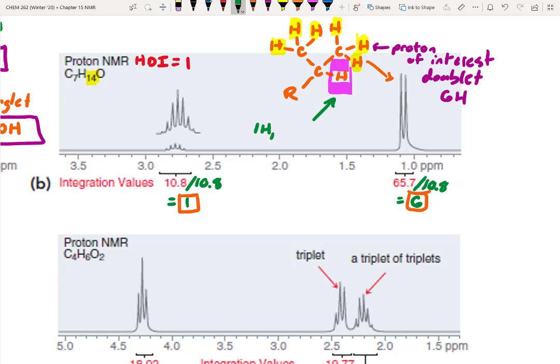Septet. Okay, which makes sense over here, because when I'm counting, I'd say 1, 2, 3, 4, 5, 6, 7. You see those 7 peaks in there? So I'd say that's probably our septet. All right, so immediately, right off the bat, we've identified all of the peaks in our NMR.